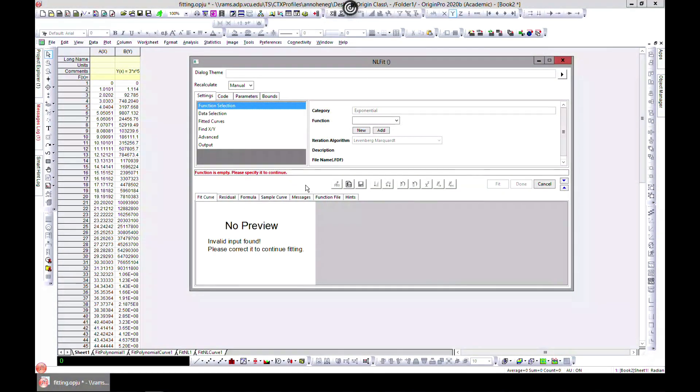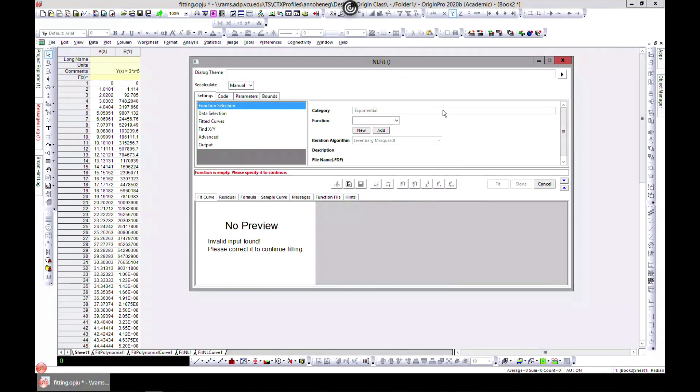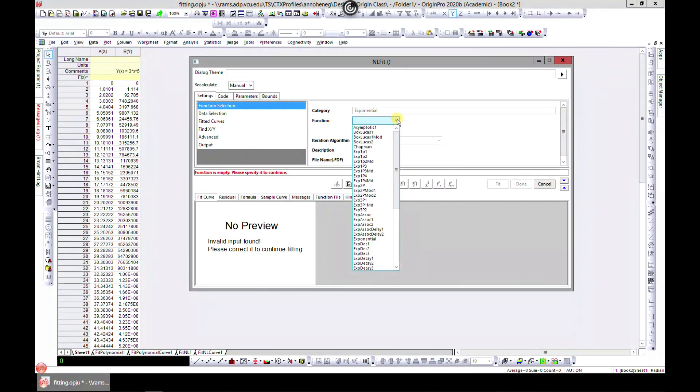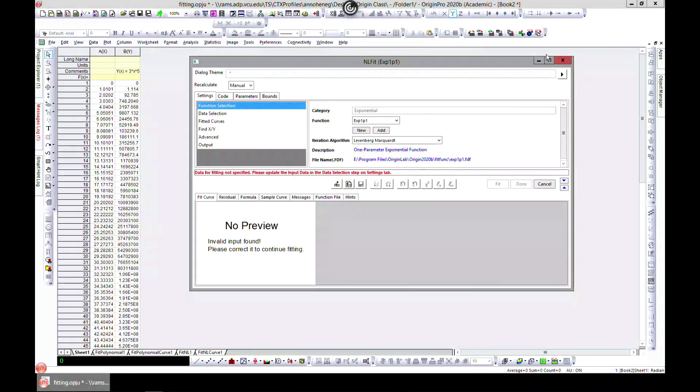and you can choose Exponential Fit. When you choose Exponential, the category Exponential is selected. If your data is exponential, because most people work with exponential data, you can just select Exponential at the beginning and everything you choose will be exponential. That is something to also note.